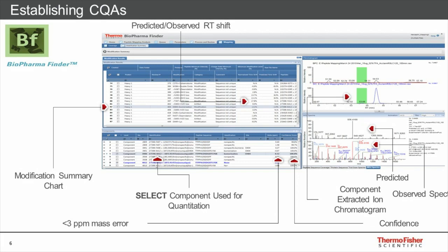When you're developing this kind of assay, you need to know which charge states to look at, right? And this is a lot of method development work. You need to know which peptide should I target that's going to have the attribute. Should I target the miscleavage or the tryptic peptide? Which one is going to have the highest signal to noise? Which one is going to have the best intensity? Which one is going to be most reproducible? I don't know any of those questions a priori.